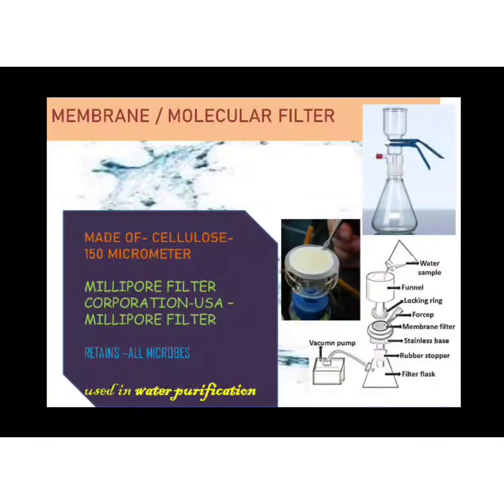Moving on to the last filter, that is the membrane filter. It is also called a molecular filter. It is also called a millipore filter. The reason being, it was first introduced in a company called Millipore Filter Corporation, which is in the USA, and that's the reason it is called a millipore filter. It can separate out all the microorganisms, even viruses, using this membrane filter, and generally this is used in water purification.